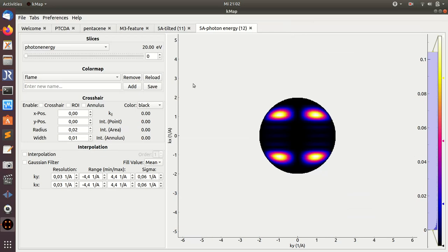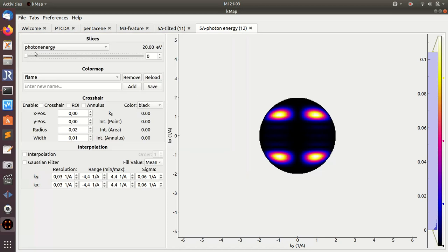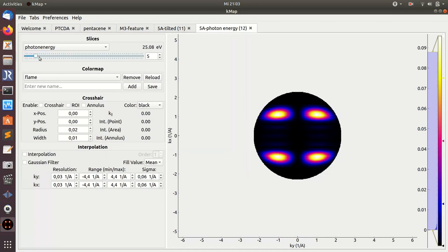And now we get the same kind of information. If I place the mouse on this tab and see, it's now photon energy as axis 0, which has a range from 20 to 80 eV. And we have KX that goes from minus 4.4 to plus 4.4, and the same for KY. And I can now change the photon energy.